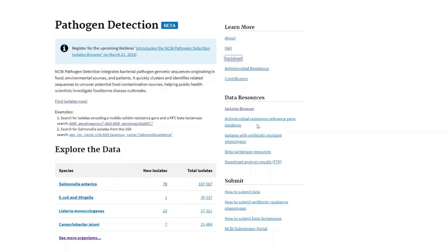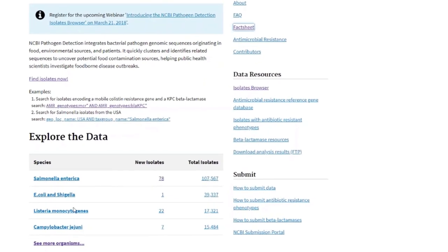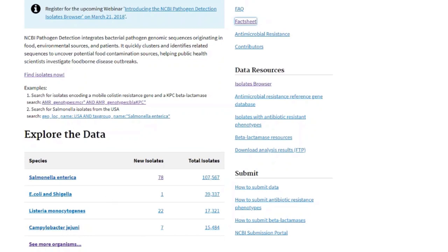If any of you are interested in submitting data, you can contact us and follow these links. For exploration of the data, we put all data available on FTP — if you want to do batch downloads, I suggest you go there. We also have 'Find Isolates,' which takes you directly to the browser, and we break it down by organism. Here we have the top four foodborne pathogens in the US: Salmonella, E. coli, Shigella, Listeria, and Campylobacter.